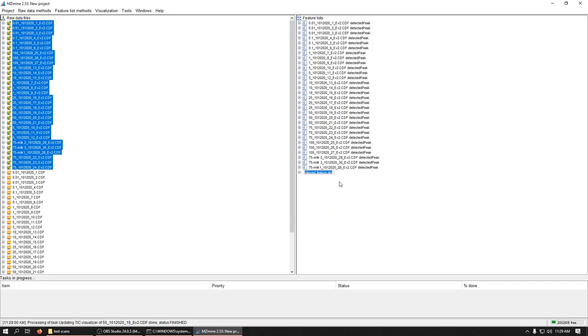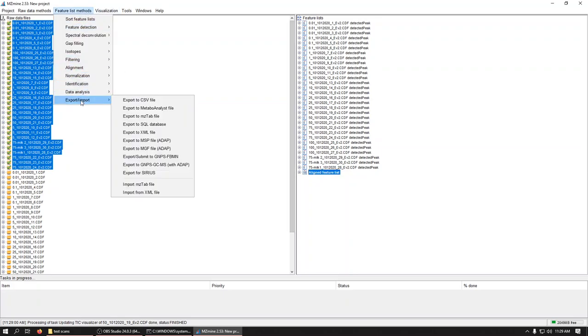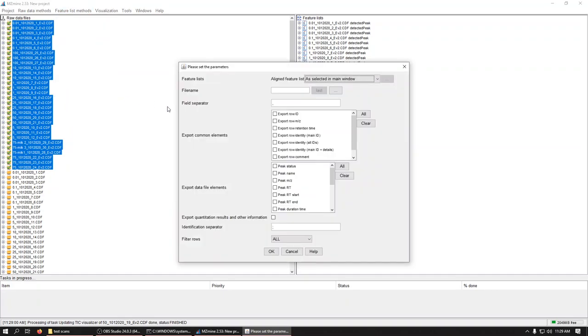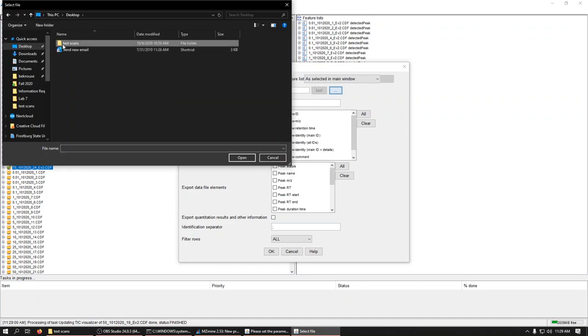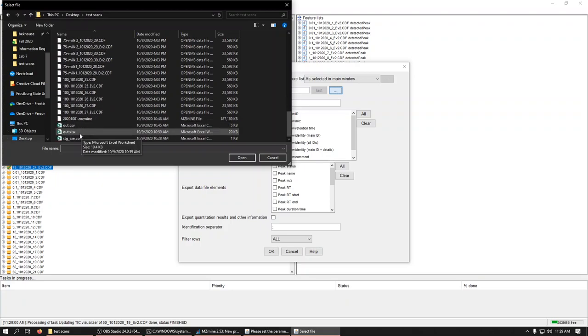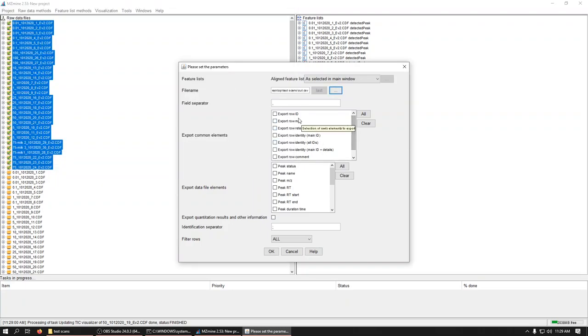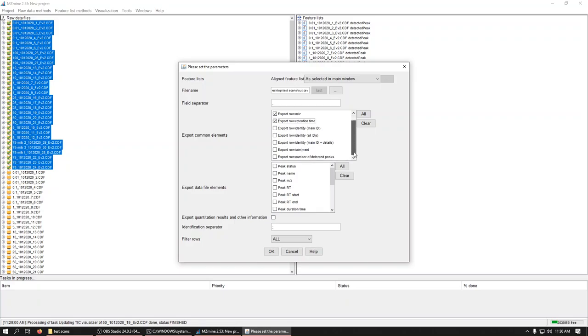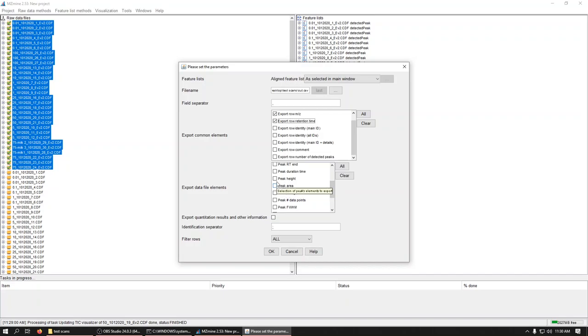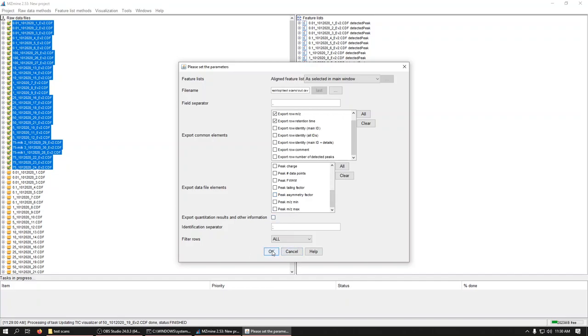So we're going to click on our aligned feature list. Not too many times or it tries to change the name. We're going to go to feature list methods, export, export to CSV file. You've got to make the file first in Excel, but it can be just an empty CSV file. So I'm going to go to desktop, my same folder, and I've got an out.csv ready. And then you need to select. If you select all, it's going to be a whole lot of stuff. So we're going to export the row ID, the row MZ, and the row retention time. And then for each peak, each peak we actually really just need the peak area. And you can see you can get a whole lot more data out if you want to compare and filter rows. And then we're going to say OK.